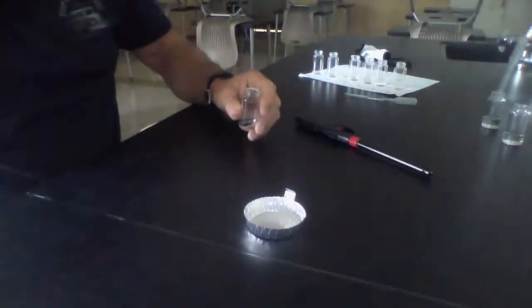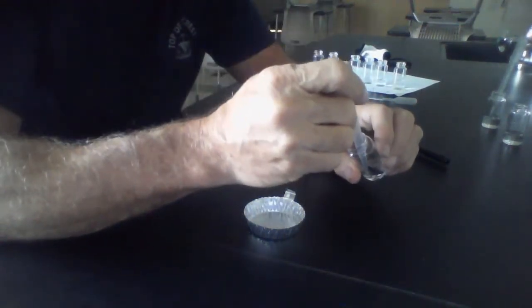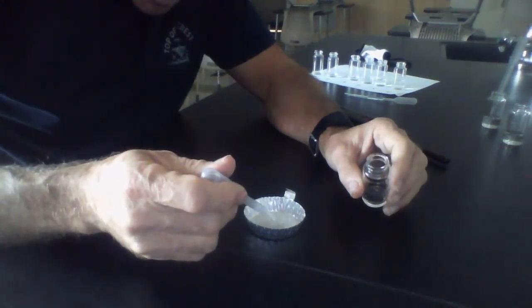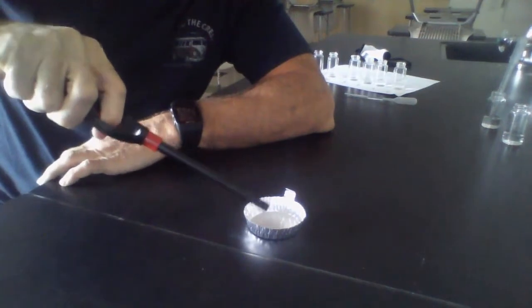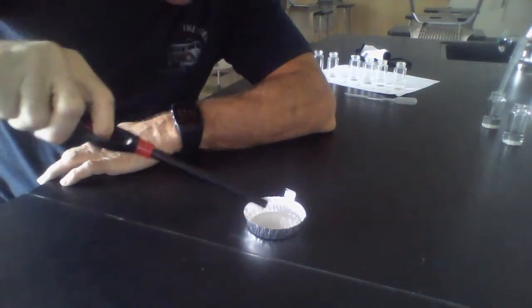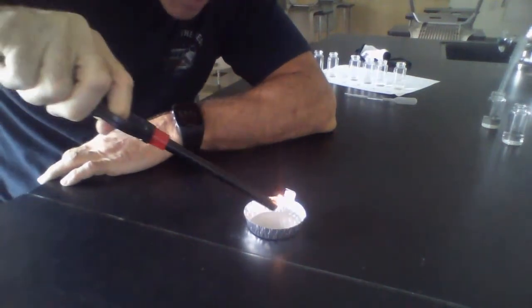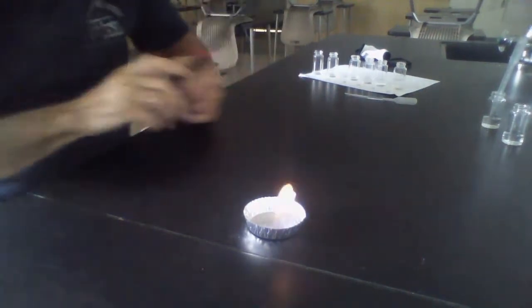I have my n-butanol. I have a fresh pipette, and we're going to do our 5 drops. 1, 2, 3, 4, and 5. Move everything far away. 3, 2, 1, ignite. Nope. 3, 2, 1, ignite. It's hard to light. 3, 2, 1, really holding it in. I got it.